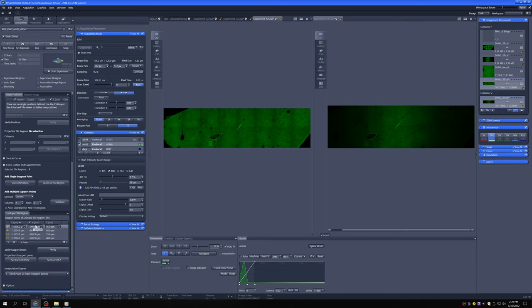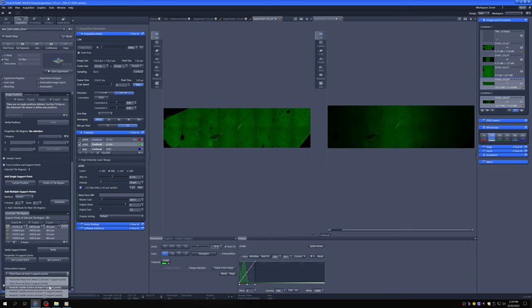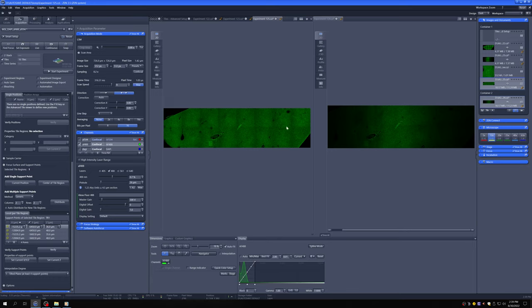Again, if you need to do something more complicated because you have a floppy sample, then you can use the onion skin method and you can use more and more complicated interpolation for the focus surface. So this is a very useful feature that I hope will come in handy to people with sections and things that are tilted.